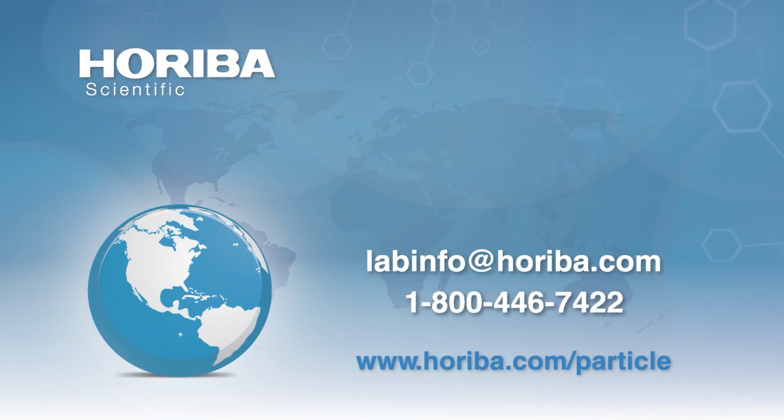In terms of whether you can use LIMS to transfer this data to another computer, we have one package today that does that, but I wouldn't want to guarantee that it's going to work for all LIMS packages. We'd probably have to talk one-on-one with what the individual had in mind, and then we could better answer the question. We also have a programmer here on site, so if the company's computer folks could work with us, we can certainly write a package to allow it to go to a LIMS system that it doesn't go to today.